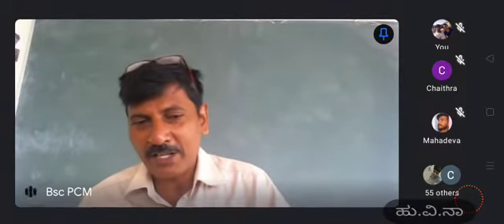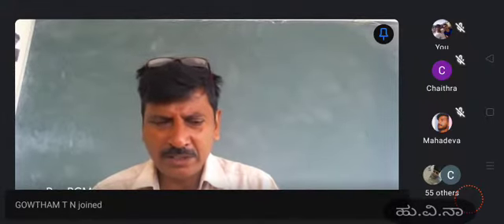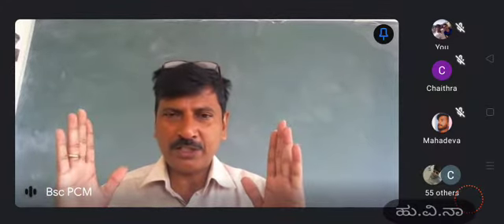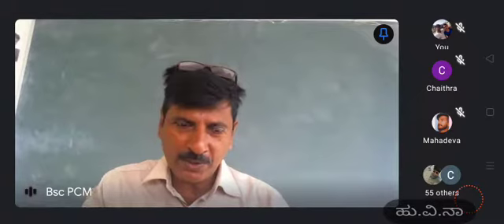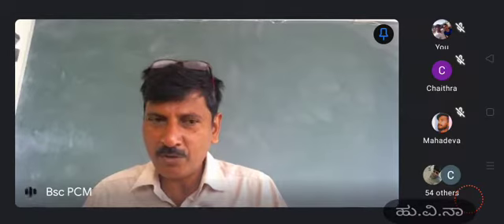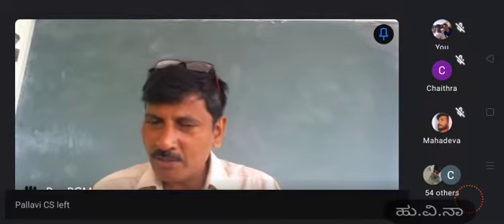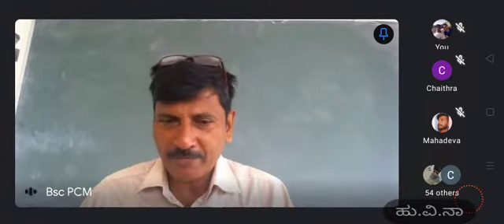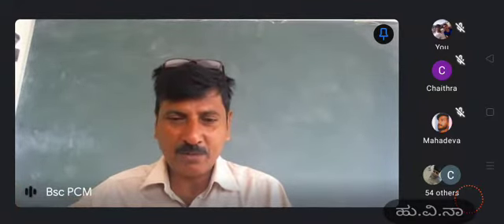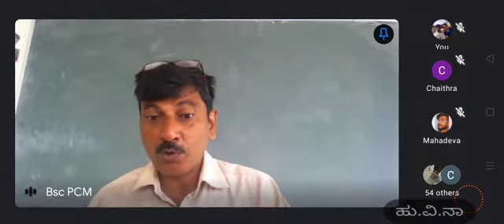NMR. So in such a way, the contribution of NMR is highly appreciable. Now I am talking about the interaction between the nucleus and electromagnetic waves, especially radio frequency waves. The energy of such waves is very low, and we need only a very small quantity of sample. We can also reuse the same sample several times, so that is another advantage. It is very useful to study natural products as well as photochemical reactions.